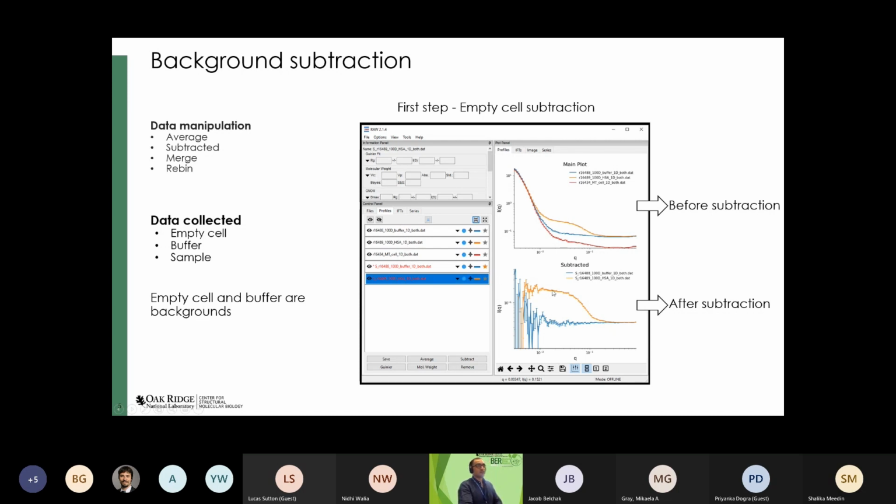And then I do the first correction necessary to analyze my data. That is the basic first step for you to move towards the data analysis. So you start removing the backgrounds of our data, doing the necessary corrections to get the scattering profile.